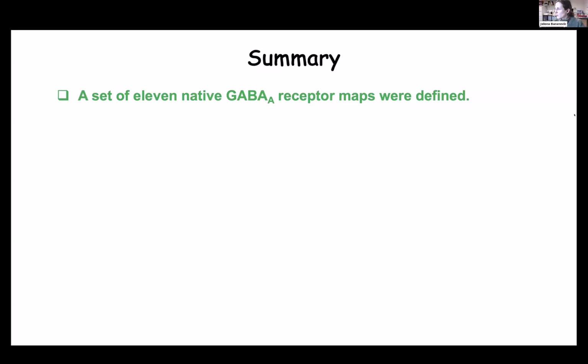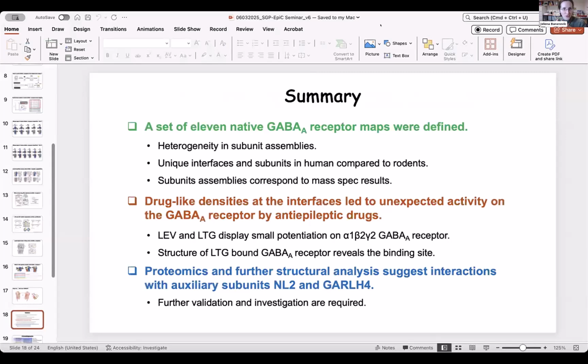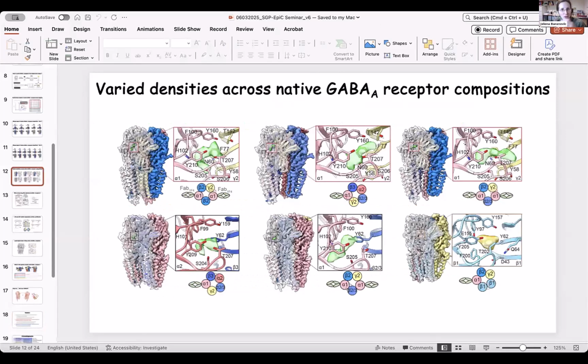Okay. I was just wondering if I may ask one more question. I think at the moment we've been through everything in the chat. So I was surprised to see mystery densities. It's very exciting, but how did they survive the purification process? I know the tissue is flash frozen, but then with the whole homogenization, wouldn't the ligand be expected to dissociate? Oh, that's a super great question.